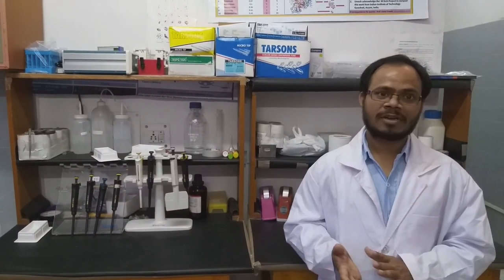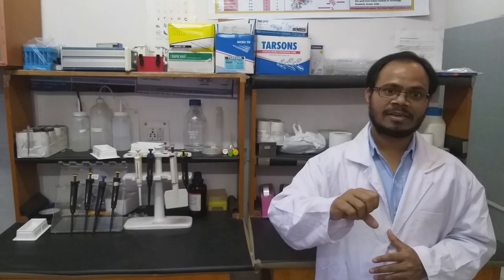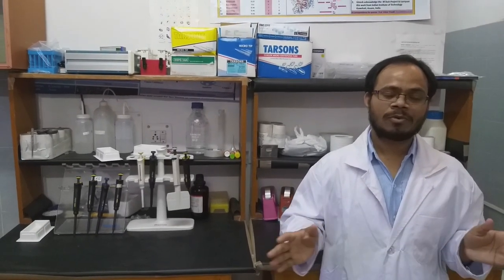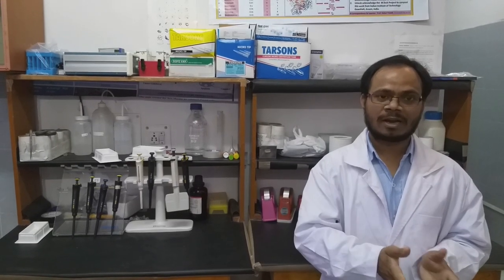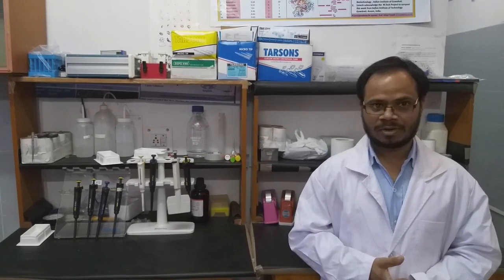After autoclaving, we should not release pressure in a single shot. Let it come down to normal pressure, then we have to open the autoclave.